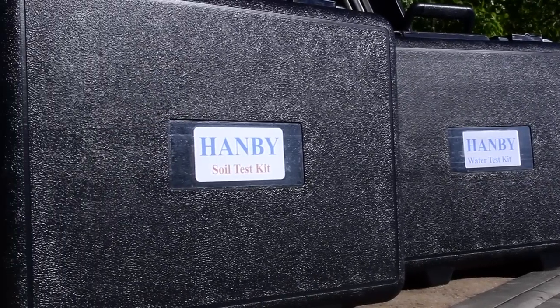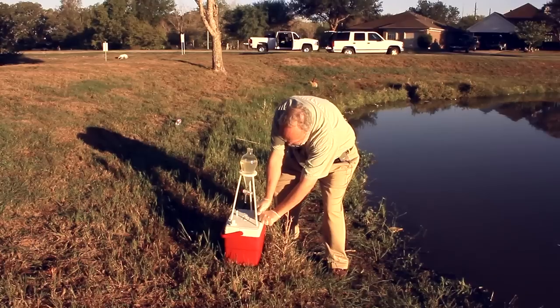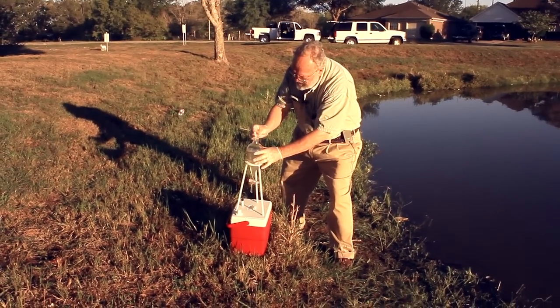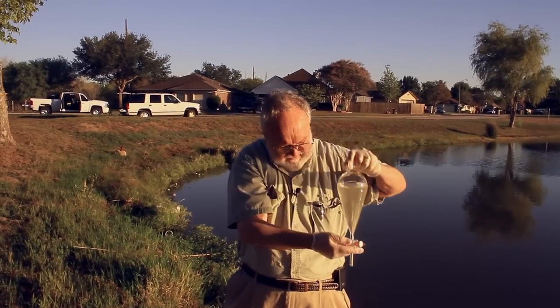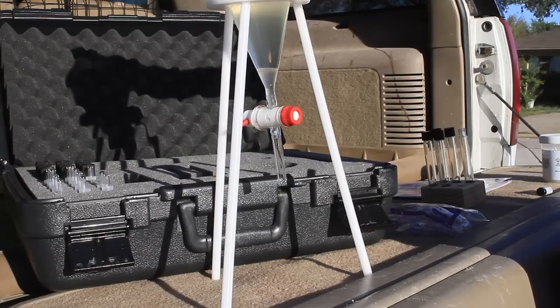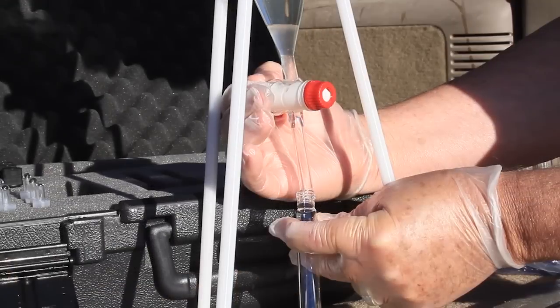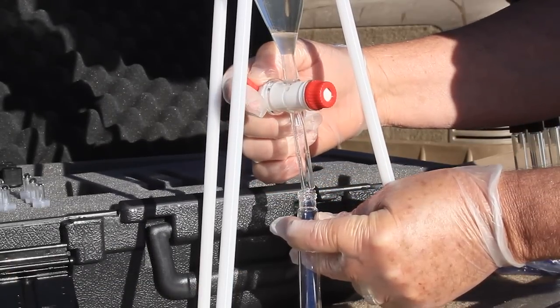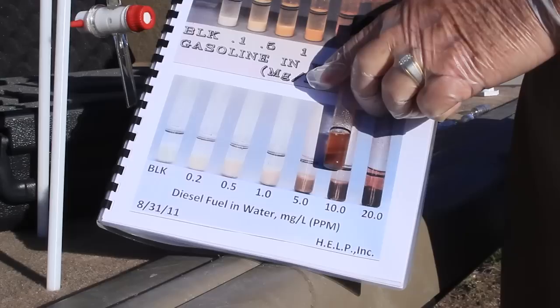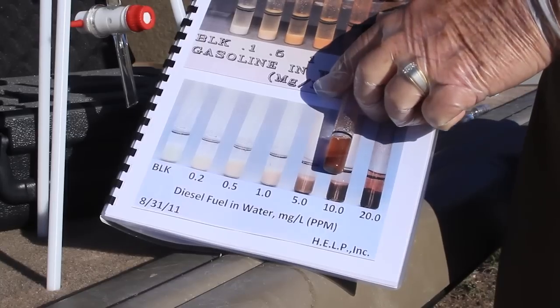Both the soil test and water test have seven simple steps. For the water test kits, follow these easy steps. Pour a 500 milliliter water sample into the separatory funnel. Snap the top off a solvent ampule and pour into the water sample. Shake or swirl the separatory funnel for two minutes to extract the water sample. Place the separatory funnel back into the tripod ring stand and allow the extraction bottom layer to separate for one minute. Then drain the extract layer into a sample test tube. Empty a catalyst powder vial into the test tube and shake for one minute. Finally, compare the catalyst color to the appropriate gasoline, diesel, or solvent calibration photo.